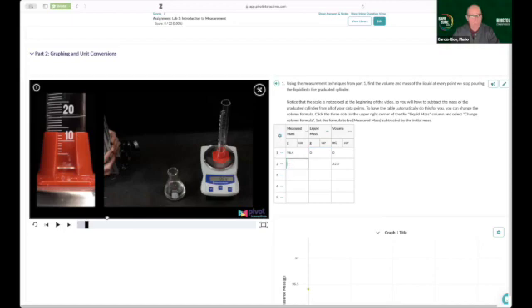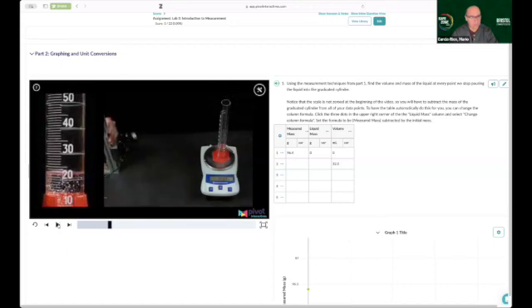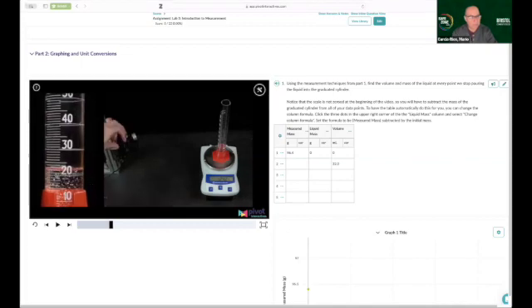Now, we're going to play the video and go to when we added the 22 milliliters of liquid, and then I'm going to pause it. So if I pause the video right here, I can see again that there are 22 milliliters of this liquid in here, which is a number that I have already over here. But the mass now is 124.2. Now that mass is of the cylinder plus the liquid. So I'm going to put it under the column named measure mass, 124.2. Now what goes here?